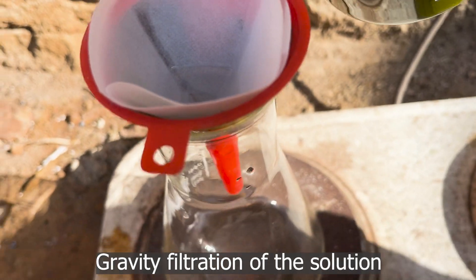After heating for half an hour and another addition of aqua regia, all the gold dissolved. Gravity filtration of the solution.